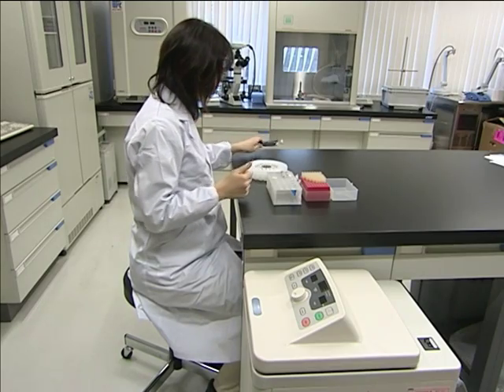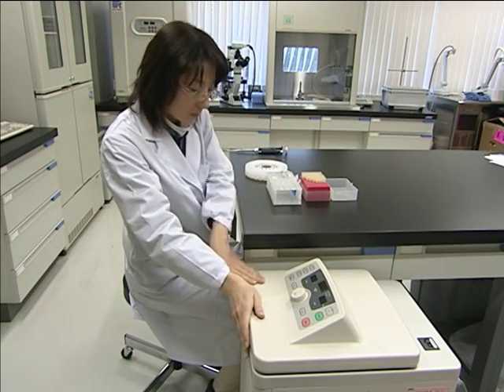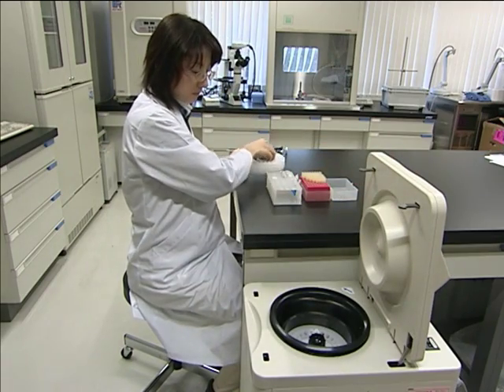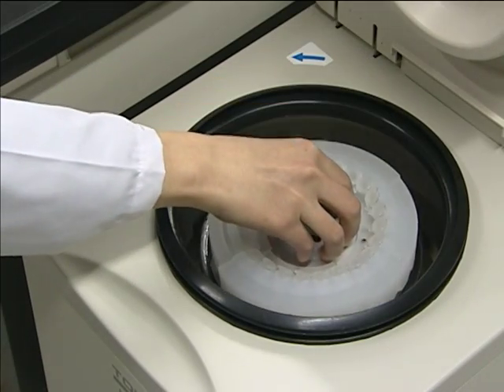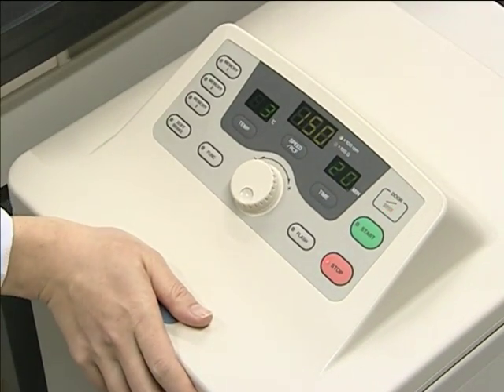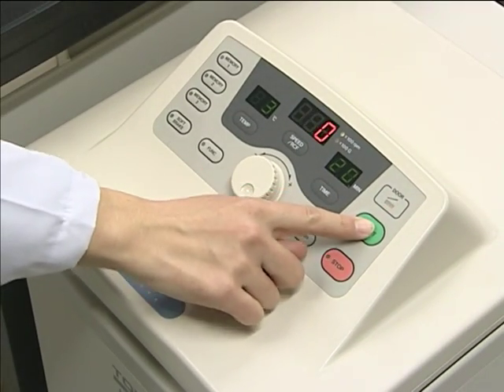Place the rotor rack on your workbench. Load with microtubes and install it into the rotor. Then, you can easily and effectively perform your centrifugation. Press the start key to begin the run.